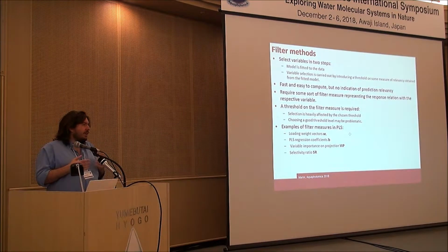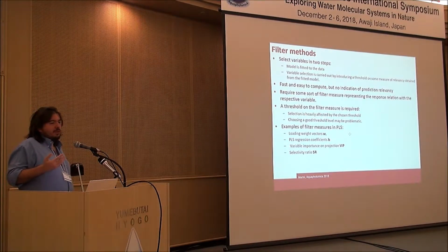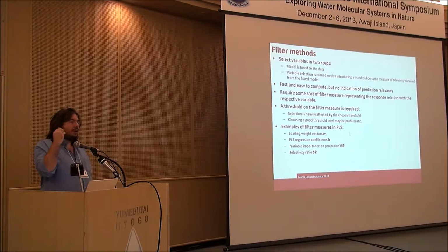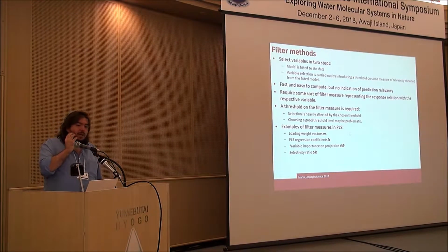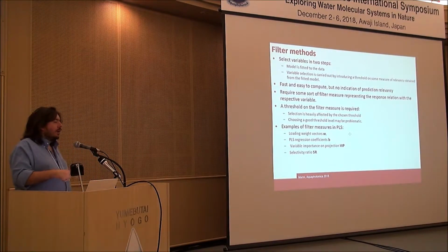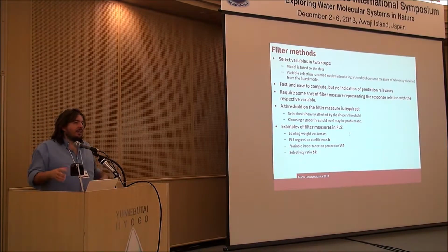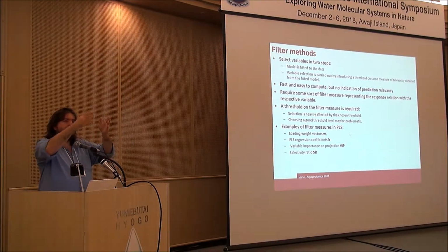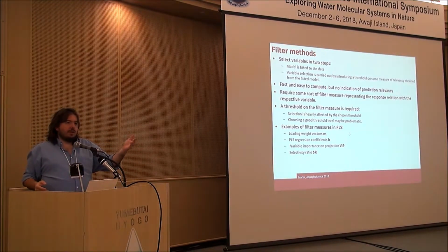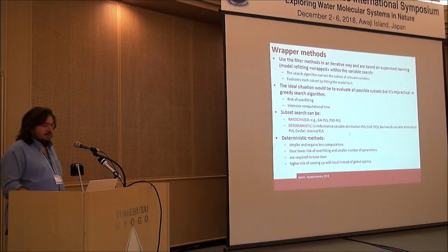And doing this is often not trivial, or at least it may be trivial, but it's not often guaranteed that it gives you relevant results, especially if interpretation is the task. And okay, it may not be the case directly for the aquaphotomics application, but also it's not guaranteed that the subset, you have no information at that stage that the subset of variables, let's say the bands that you isolate, may also have a real predictive improvement or predictive ability per se. So this is another different advantage.